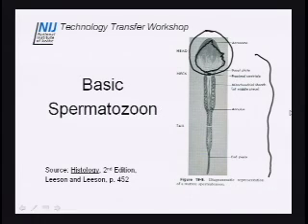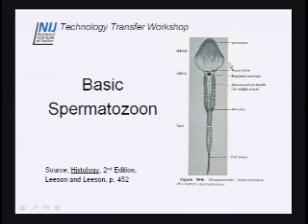The nuclear material is stained red. The acrosome, which is this top portion, is clear. So those two things, at least for me, help me to really be able to feel more confident when I'm looking at sperm on a slide, especially if it's just a head and no tail. And what I generally do is I'll take that fine focus and kind of move it in and out, and that helps me to really see that acrosome versus the red stained nuclear material.